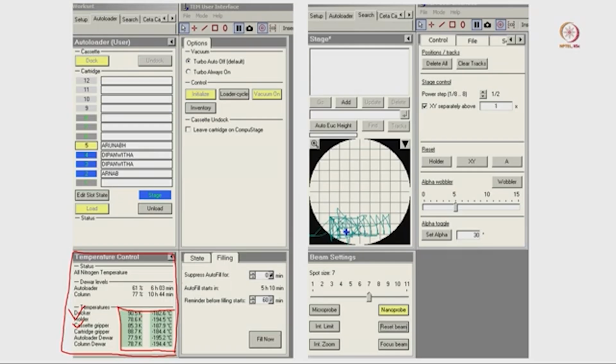That is the major difference between a room temperature microscope, or normal temperature transmission electron microscope, and a cryo-electron microscope. In a cryo-electron microscope we also use a transmitted electron beam, but the sample is maintained at this low temperature. The electron beam is not at cryogenic temperature, the electron beam is as it is. Only the sample holder region we keep at a very low temperature.